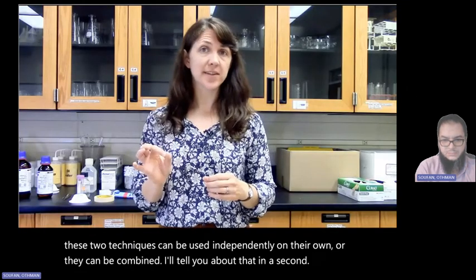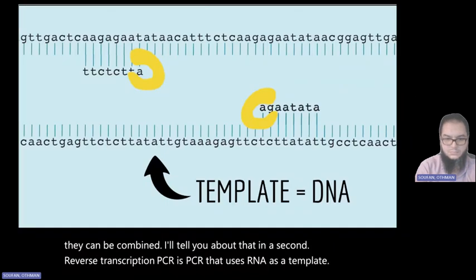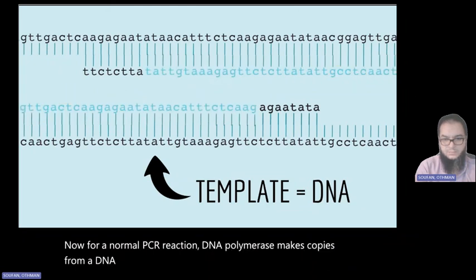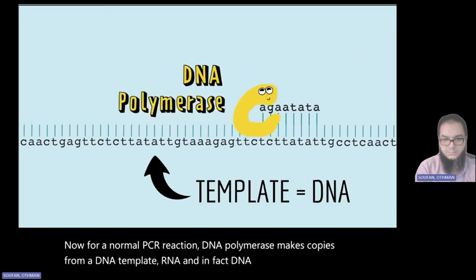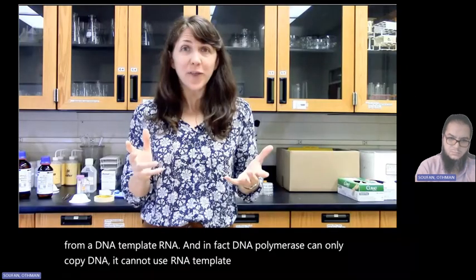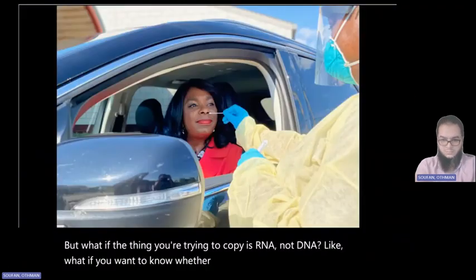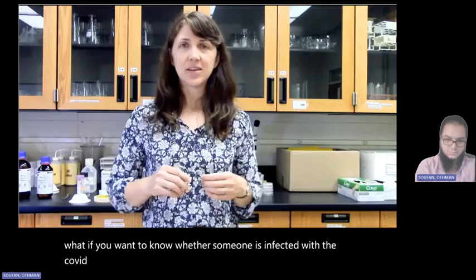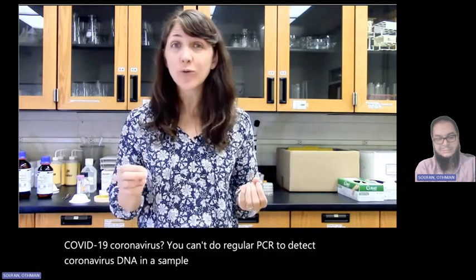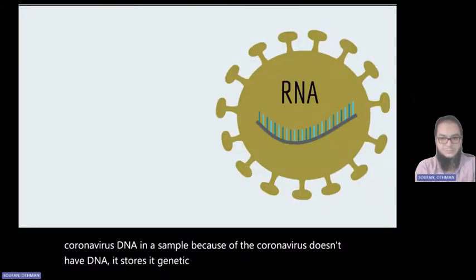Reverse transcription PCR is PCR that uses RNA as a template. Now, for a normal PCR reaction, DNA polymerase makes copies from a DNA template, not RNA. And in fact, DNA polymerase can only copy DNA. It cannot use RNA as a template. But what if the thing you're trying to copy is RNA and not DNA? Like, what if you want to know whether someone is infected with the COVID-19 coronavirus? You can't do regular PCR to detect coronavirus DNA in a sample because the coronavirus doesn't have DNA. It stores its genetic information as RNA instead of DNA.